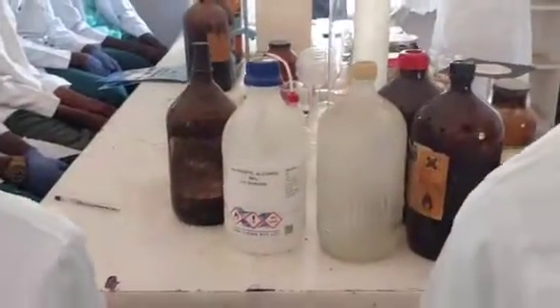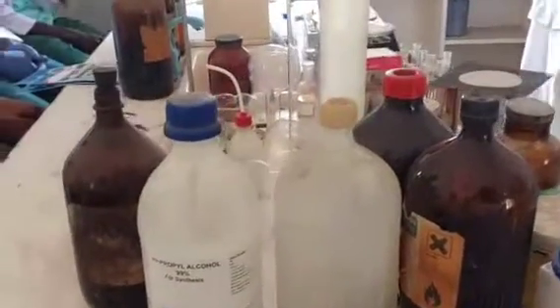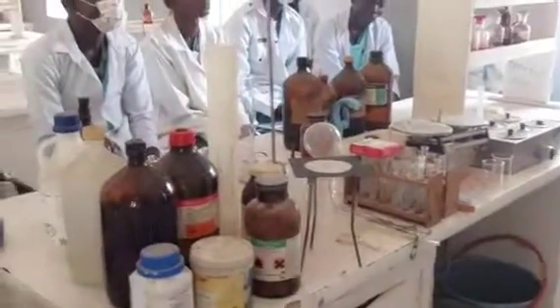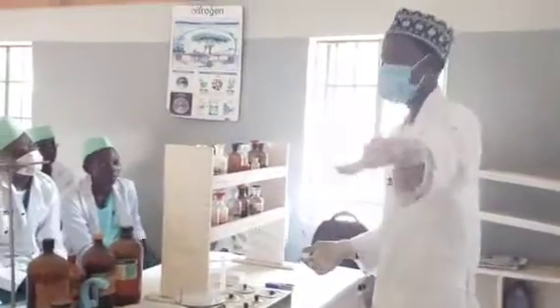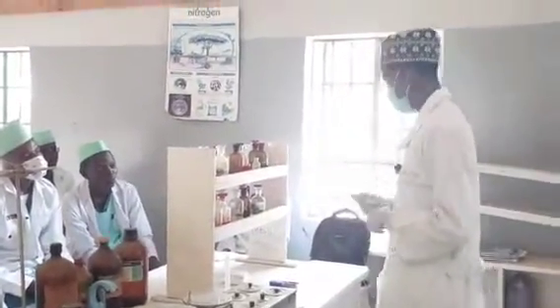And the last but not the least is that you should report any accident if it occurred. Under this, you are not supposed to work alone in the laboratory. Under laboratory ethics, working alone in the laboratory is not advisable. Why? Because in the case of any accident, maybe someone will help. So even if he is not going to be part of the analysis, he should hang around somewhere. At least you should be supervised, or have someone stay nearby in case of any accident.